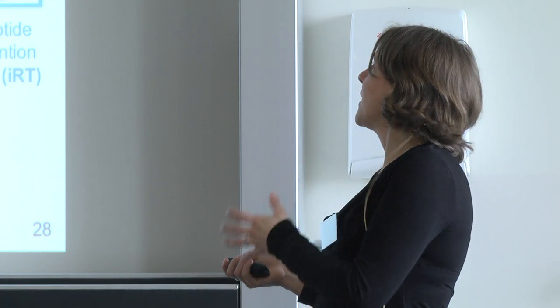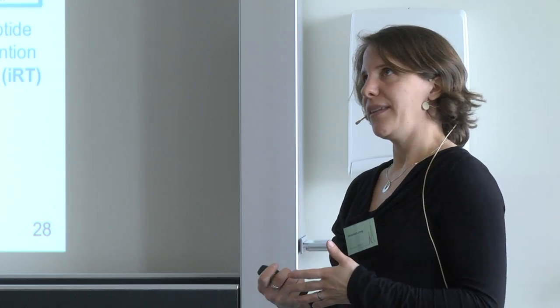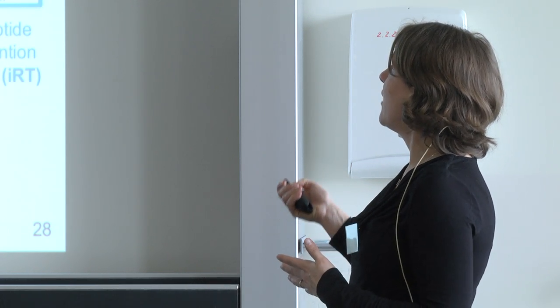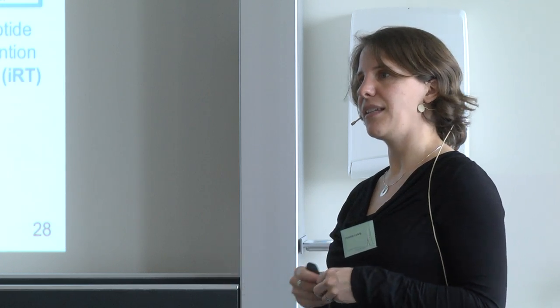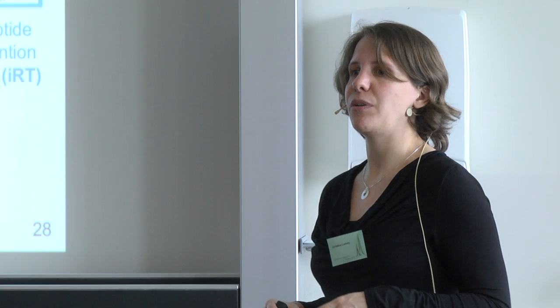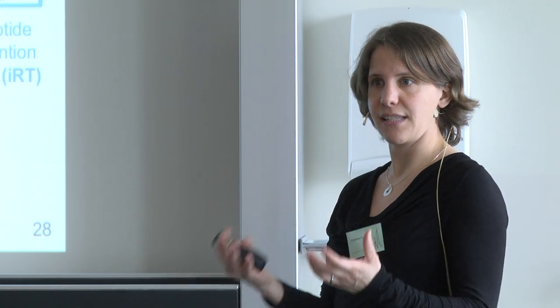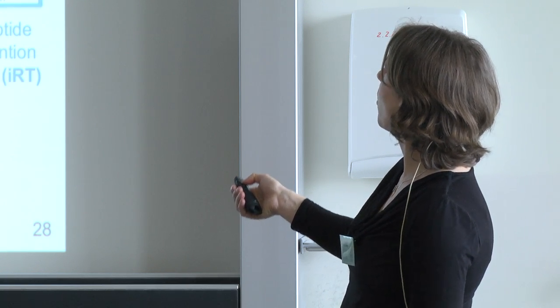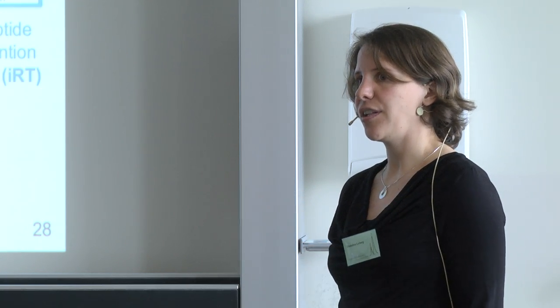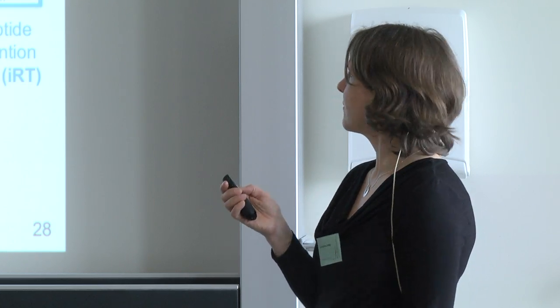So retention times are always LC setup dependent. A much better way to store retention time information is to normalize it so that you have unit-free retention time information that you can easily transfer between different LC setups. And this is what we call the normalized or iRT retention time, and you will learn a lot about this later throughout this day.